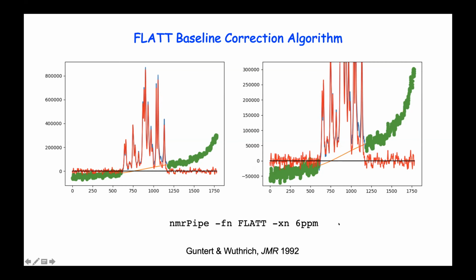So you only need to extract the other part. And sometimes I also put another option called dash first, dash last, meaning that the first and the last segments are always considered baseline and should be used for baseline.